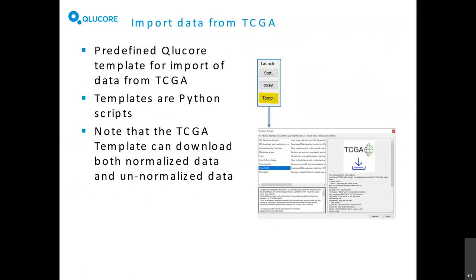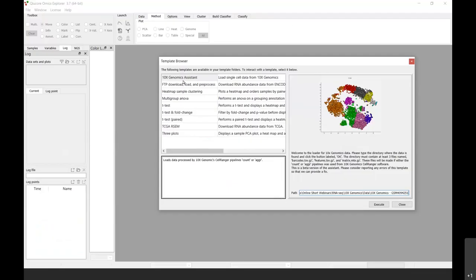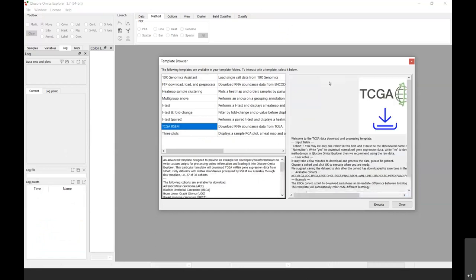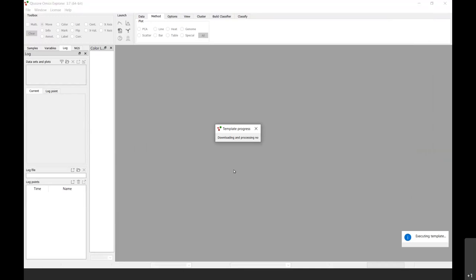Some customers are also working with TCGA data, which is also publicly available. You just have to comply with the required terms for downloading. We have a template for this too, and data will be downloaded directly into the tool. Under Templates, go to the TCGA part where you have a number of different cohorts to choose from. Select one, choose normalized or non-normalized data, and press Execute. It will start downloading the data. Here is an example dataset with 196 samples and around 20,000 variables that has been downloaded.